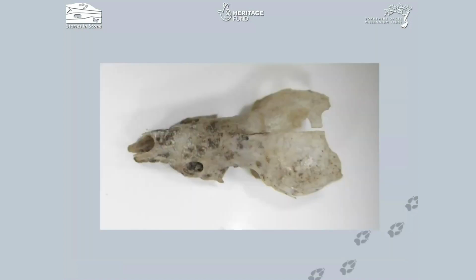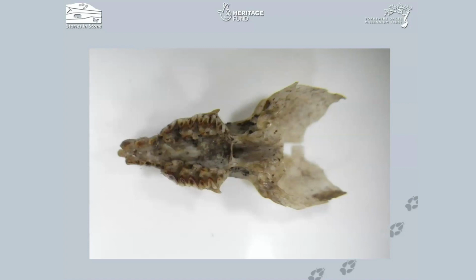We've got some photos here, so this is a photo just to reiterate what we were saying about the structure of the shrew skull. We've got the main skull element and then an elongated section, which is the nose part of the head. We can see it's quite narrow. And if we flip it over, we can see the teeth. They're quite sharp little teeth, and you can see the red tint to the ends of the teeth. Unless they're quite well worn, then all of our shrews have that red tint at the end of their teeth.